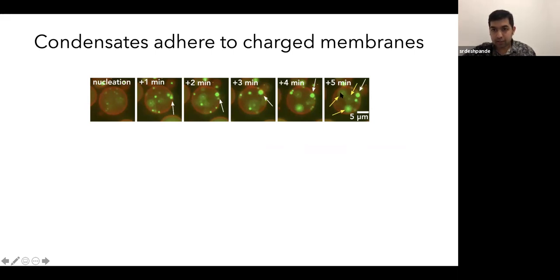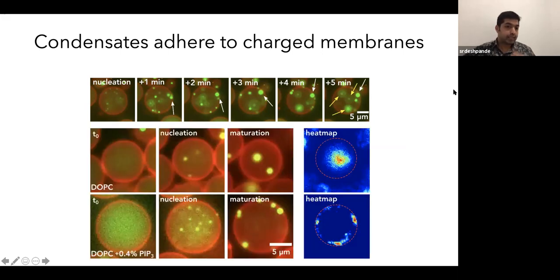You can see it a bit better here that the nucleation starts everywhere, but once the condensates touch the membrane, they just stay there. They just even keep on growing. And those that are out of focus are basically not at the membrane suggesting that they are either at the top or the bottom membrane of the liposome. Things become even more clear when you compare that with pure DOPC membrane, where you can see in the heat map that the distribution of the condensates is really in the center over time. And for the DOPG liposomes, you get nice localization at the membrane.